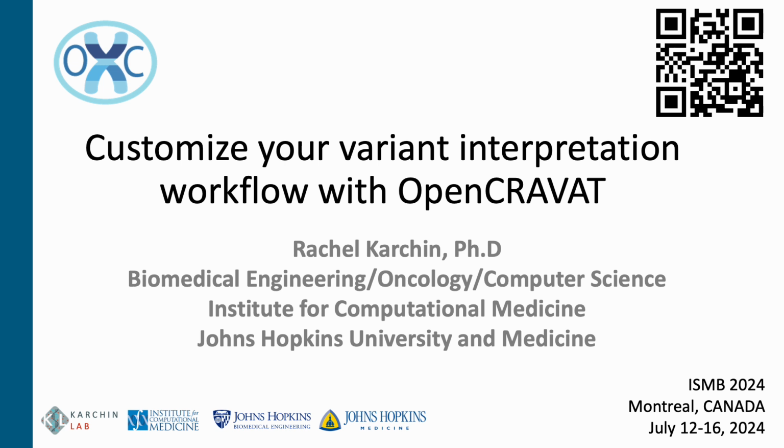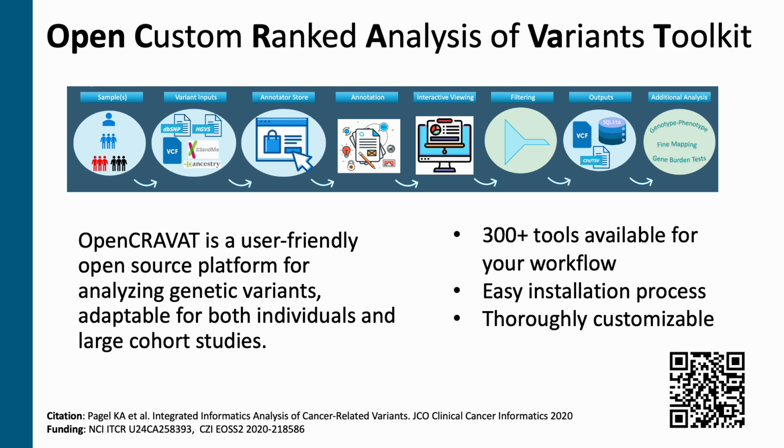Today I'm going to talk to you about how you can customize your variant interpretation workflow with OpenCRAVAT. OpenCRAVAT is an acronym for the Open Custom Ranked Analysis of Variants Toolkit. OpenCRAVAT is an open source platform for analyzing and annotating genetic variants.